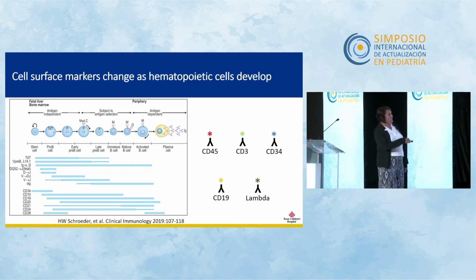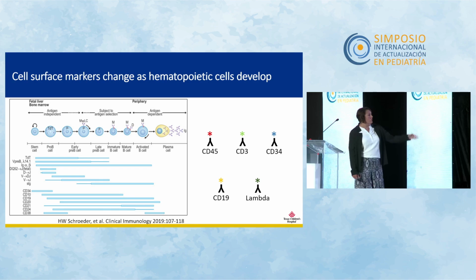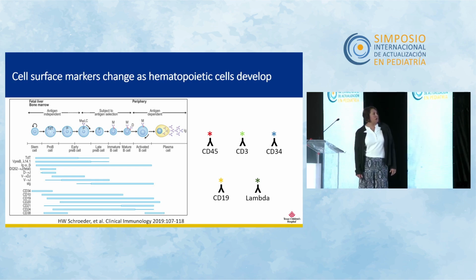At the same time, what I was trying to represent over here is a small panel of markers that we might put into flow cytometry. So you see CD45 is a hematopoietic marker. It's positive for most hematopoietic cells. In this case, I have it tagged to a red fluorochrome. Okay, so the idea is you have an antibody, which is your upside down Y here, that targets CD45 and is conjugated to a fluorochrome. We have a different antibody for CD3 with a different color, CD34, CD19, and lambda. So just within a mix of these antibodies, they all have different colors, and you can simultaneously look for all of those cell surface markers.